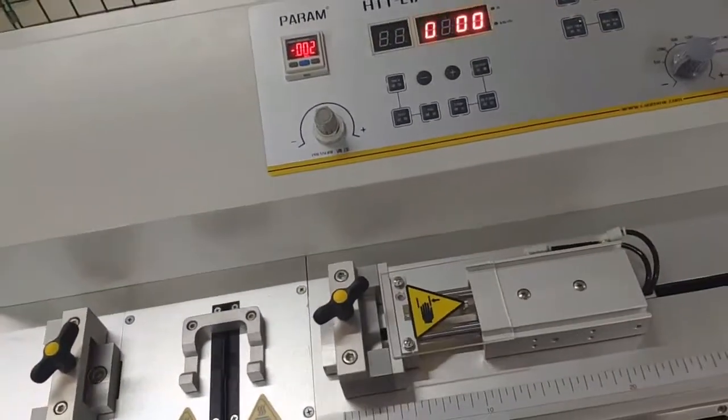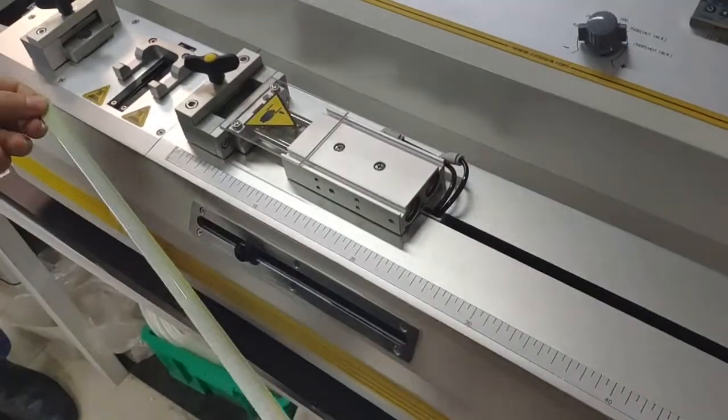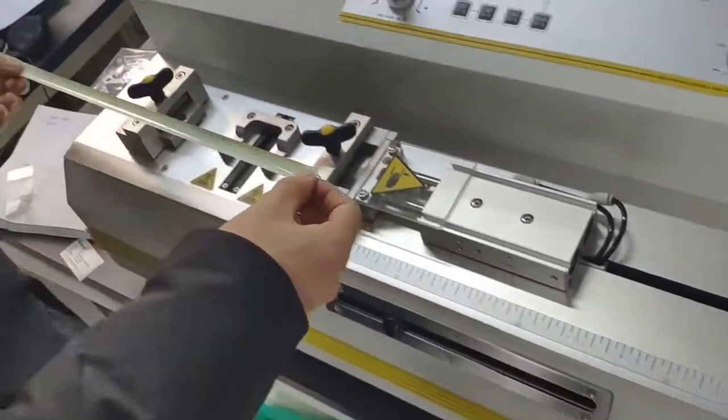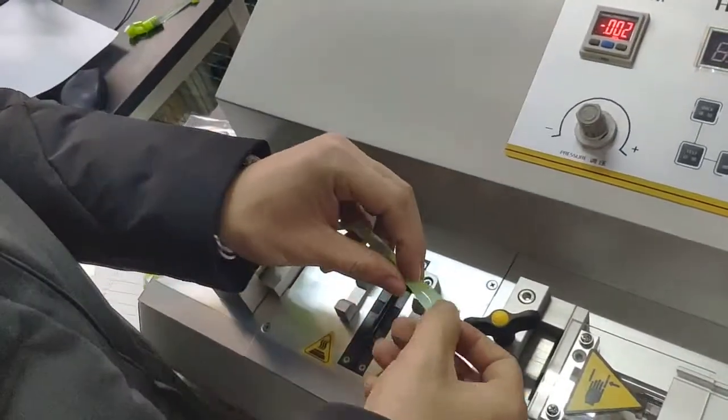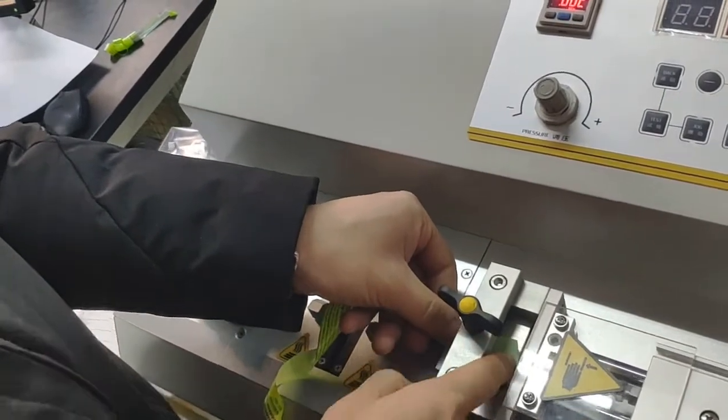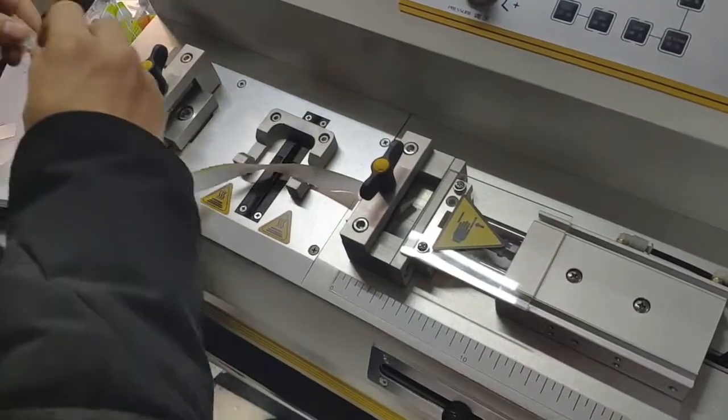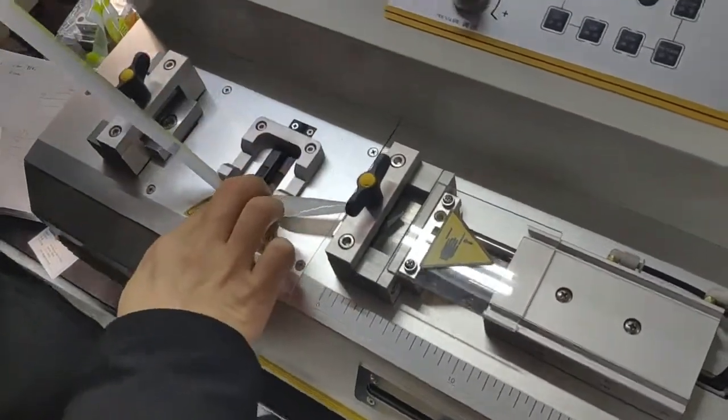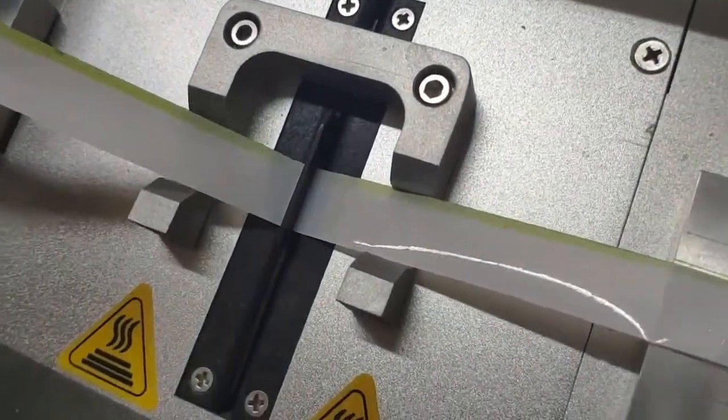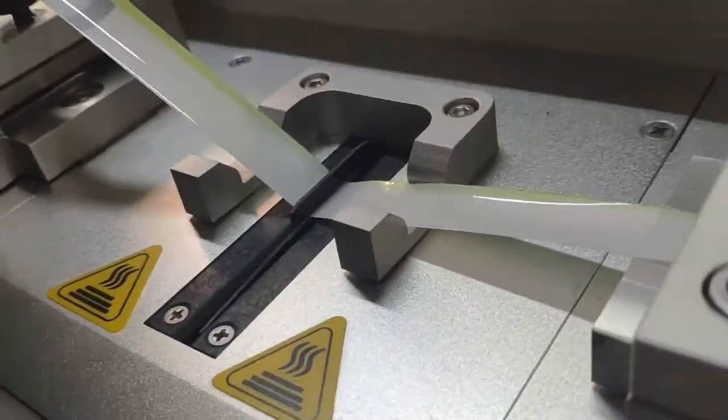Before starting a real test, there are some points you have to pay attention to. First, the sample strip must be 40 millimeters length. Now install the sample. Put the sample through the hook in the middle part.